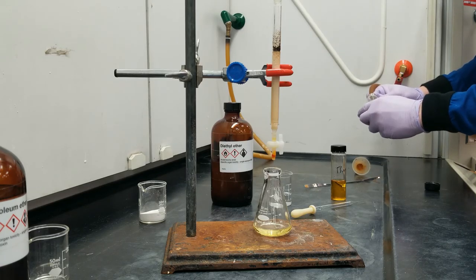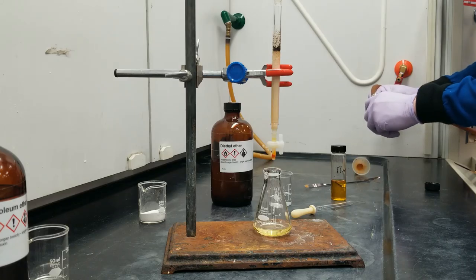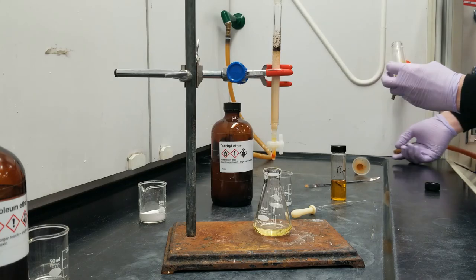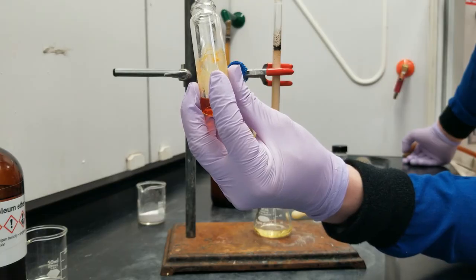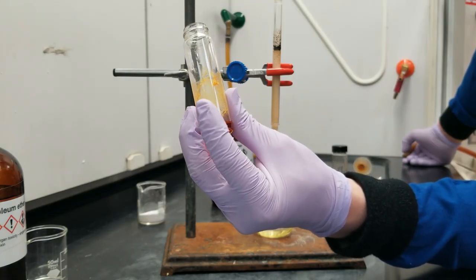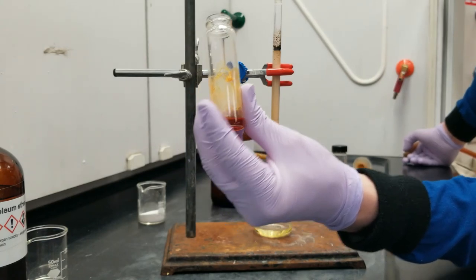I'm also rotating it, kind of like how a rotovap works. This just maximizes the surface area of solvent that I'm removing at any given time. So, check that out. See how that solid is being deposited on the walls of the container? I'm just going to continue doing this. It's going to keep depositing solid until all the solvent's gone.